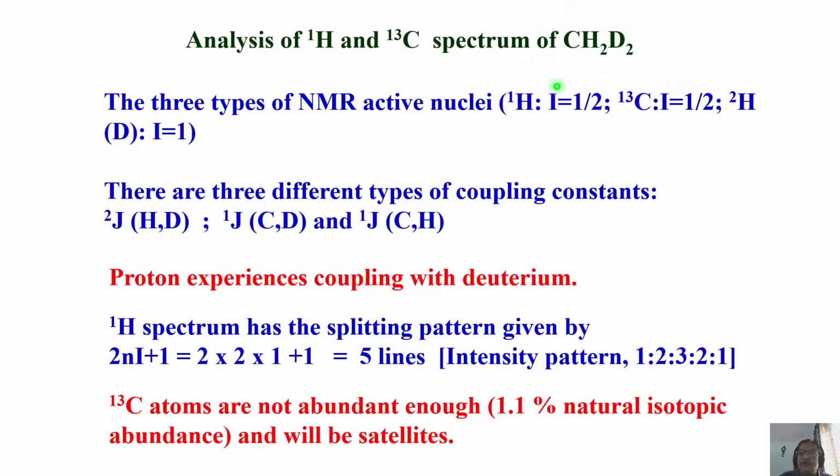When you look at carbon 13 NMR, you are not worried about isotopomers. You are directly looking at the carbon 13 isotopomer. When looking at proton, you have to say that 99% of the molecules have carbon 12 and 1% have carbon 13. But now you are directly looking at carbon 13.